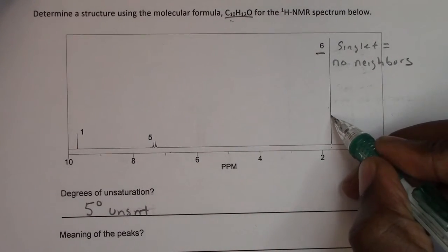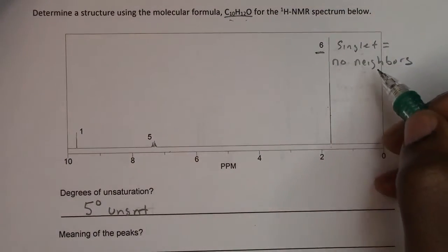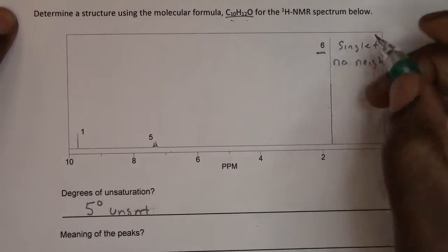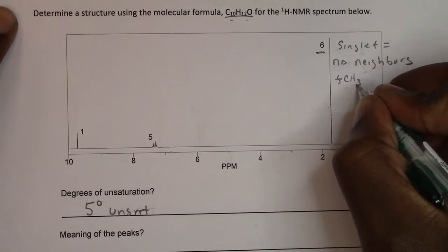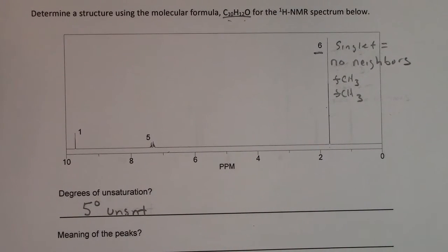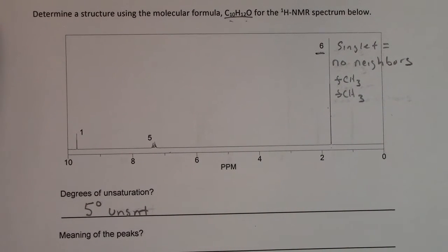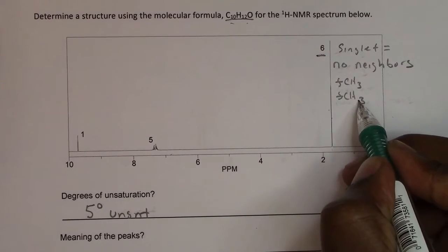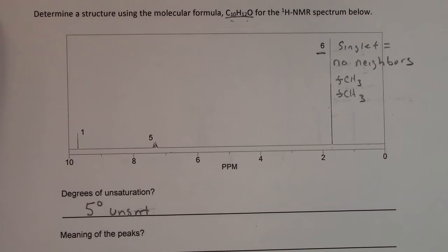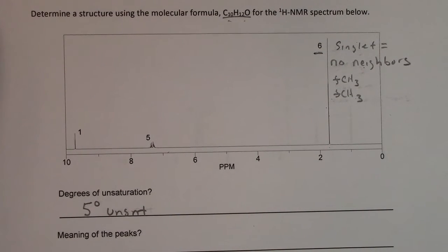They also can't be the hydrogens of an alcohol, because we only have 1 oxygen, and we would need 6 oxygens for that. So the simplest possibility is that we have 2 CH3s associated with this peak. We want to roll with the simplest possibility first because it's the easiest thing to possibly rule out. So this peak that integrates to 6 is most likely 2 equivalent CH3s, which have no neighboring hydrogens of a different type.